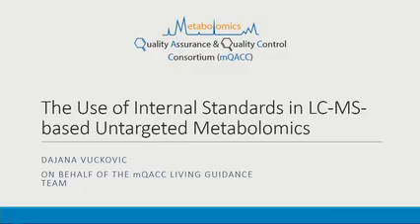Excellent. So today we are focusing on pooled QC's, internal standard and design of analytical batch. The guidance will have a reference material section, but we are not going to discuss that today. Just in interest of time, we could not cover all the topics, but you're completely right. Reference materials are definitely key.